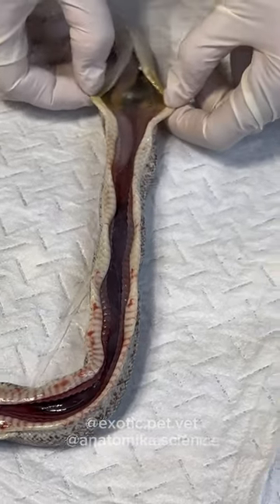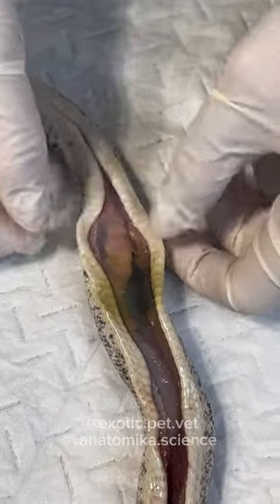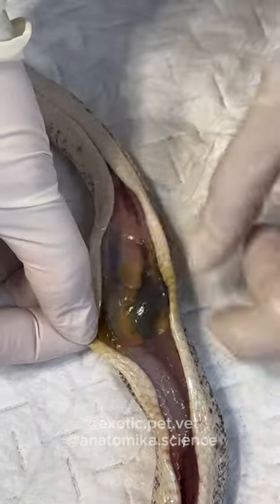There's the stomach and there's the gallbladder — that's the green part. And you're starting to see fat deposits right here.